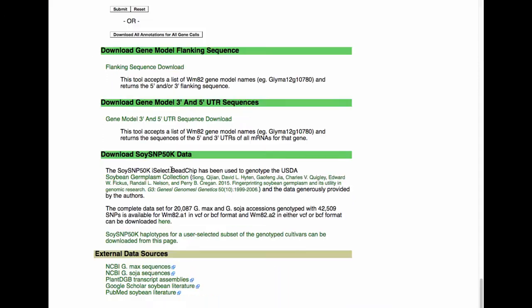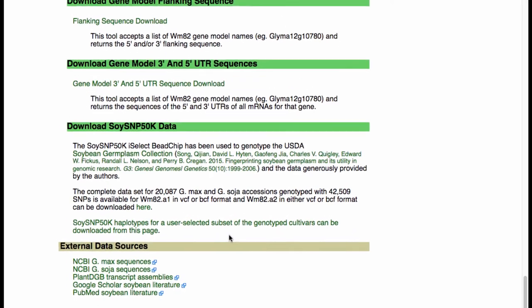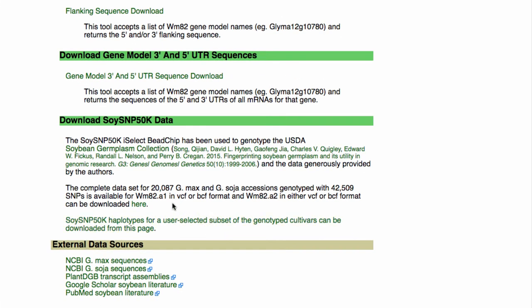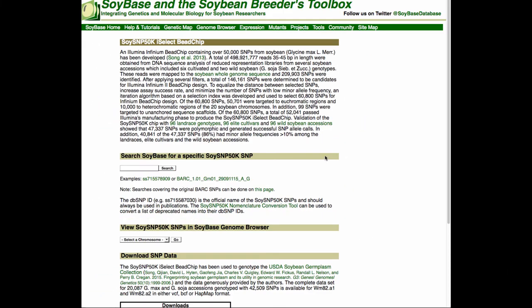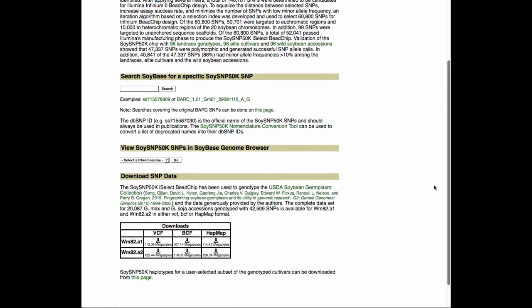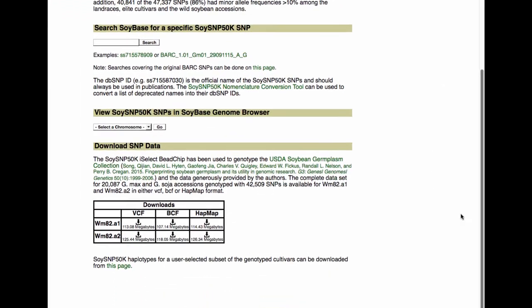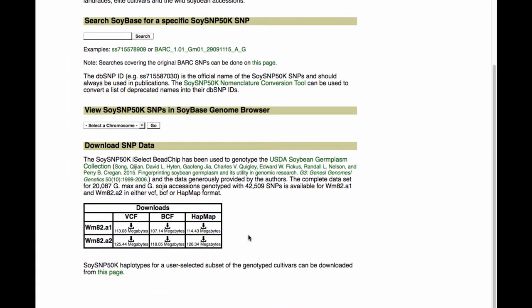We click on that, which will take us to a page that describes a little bit about the Soy50k data. And if we click the link here, we'll be taken to the Soy SNP50k page. At the bottom is a table which allows you to download the results.